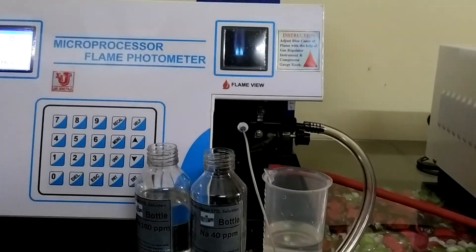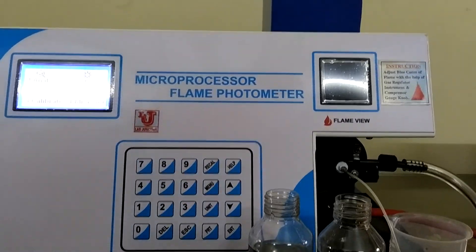This is the final demonstration of the microprocessor flame photometer. Thank you.